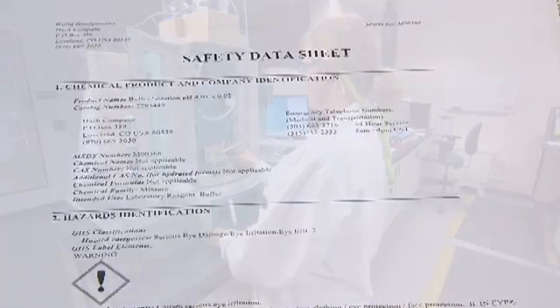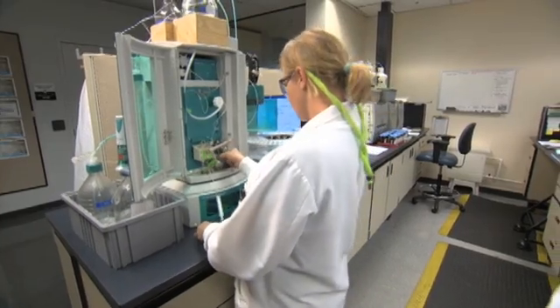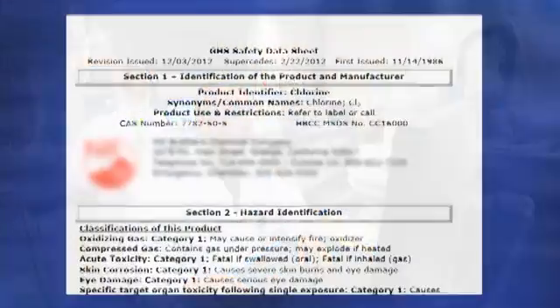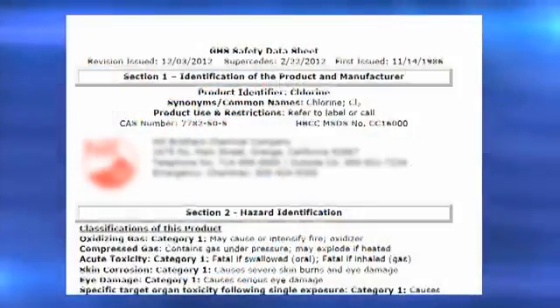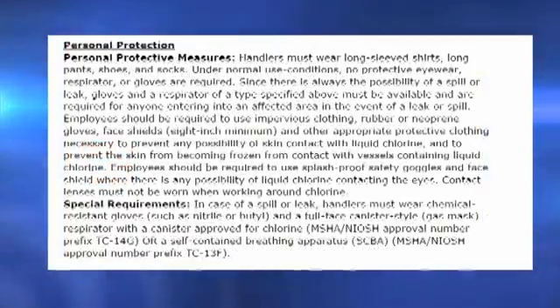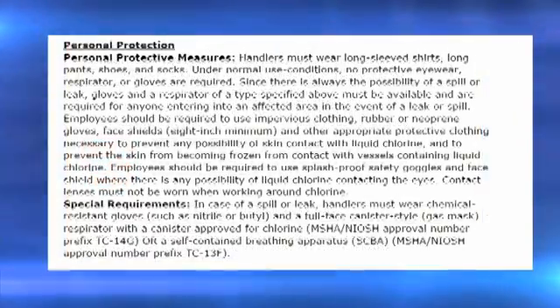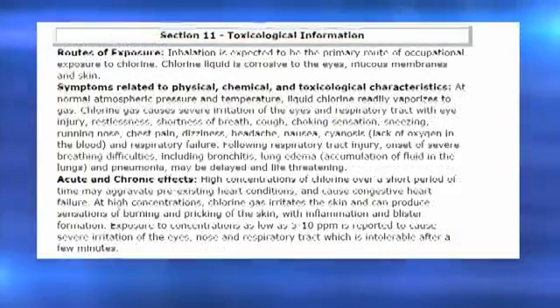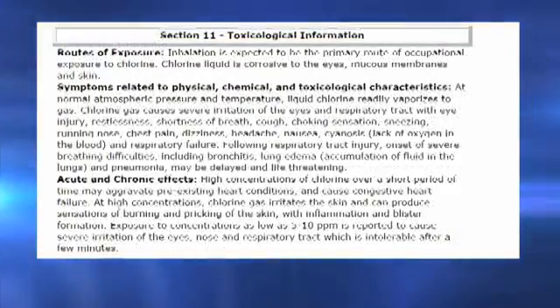Safety data sheets, formerly known as MSDS, must be printed in English and be in each work area where the chemical is used. These documents are the primary source and provide the greatest detail about each chemical to workers. The SDS will verify the information on the chemical label, help you determine what personal protective equipment or PPE is needed, and tell you if symptoms you may be experiencing might be caused by the chemical.